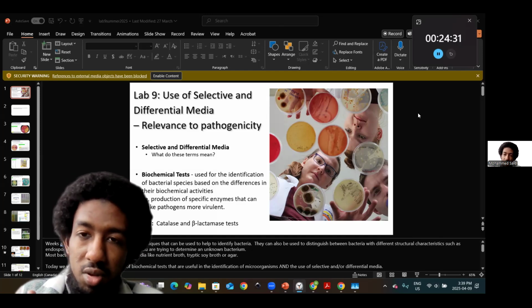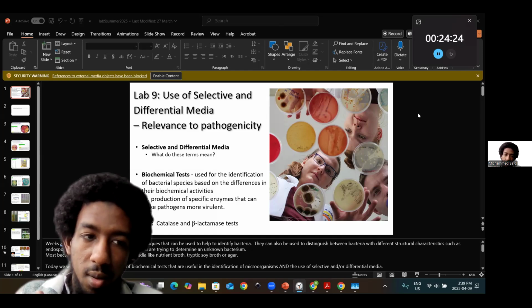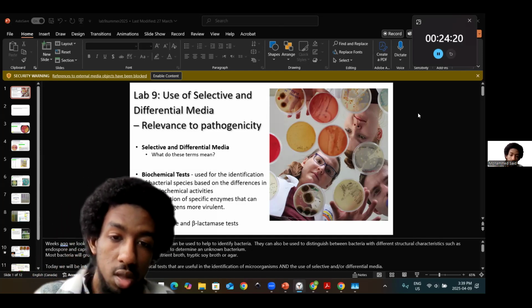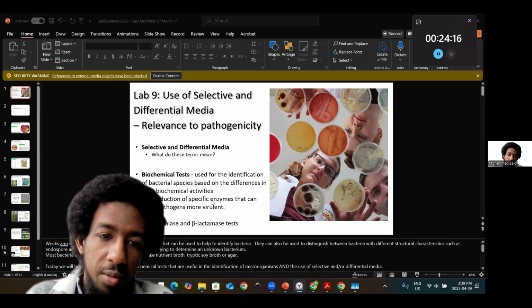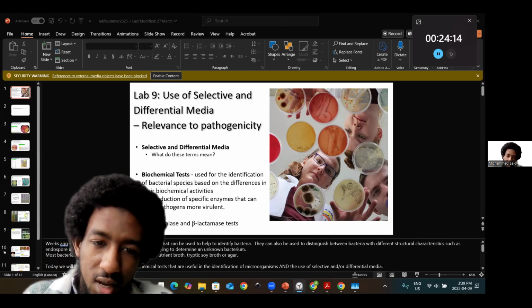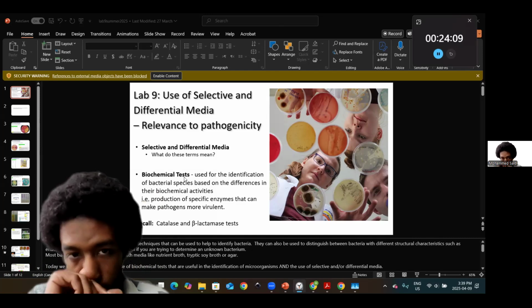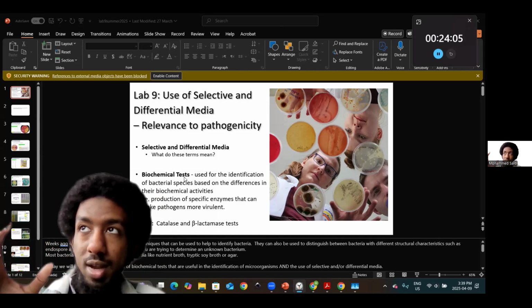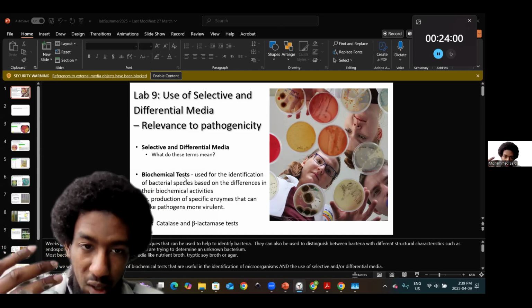We've looked at many different types of differential stains, different techniques, apparatuses, methods, and different extensions, limitations, and applications. And I hope you can appreciate them in this integration of our Golden Lab series. So you have catalase and beta-lactamase, which exist as biochemical tests, a separate component to understand, but essentially you're now able to identify specific properties of bacteria biochemically.